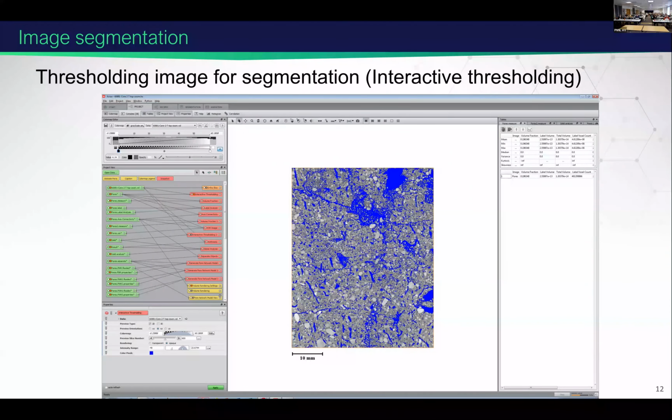Here, our main intention is to get only the pore information, because porosity and pore network will play a vital role in guiding the nutrients, water, and other soil matrix and soil organic material throughout the soil.